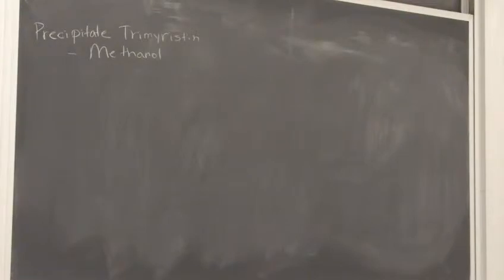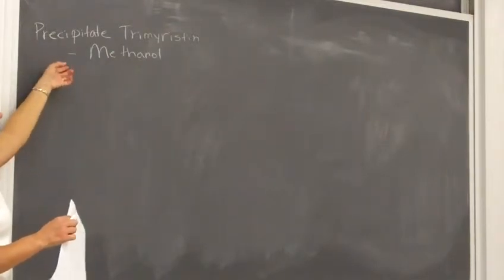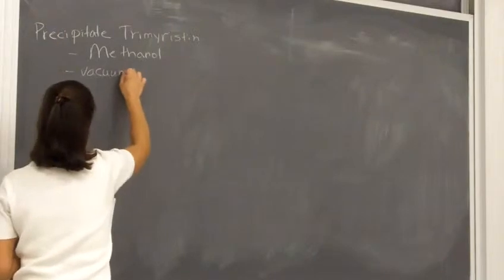It takes a little bit for it to precipitate, so sometimes if you put it in a cold water bath, not ice bath, but just cold water bath, and swirl the flask in the cold water bath, see if that helps to get the solid to precipitate out. If you're still not getting any solid, talk to your lab prof and see what you need to do, okay? But at this point, especially once you've swirled it in a cold water bath, you should definitely get solid, okay? Then you're going to use vacuum filtration to isolate it.